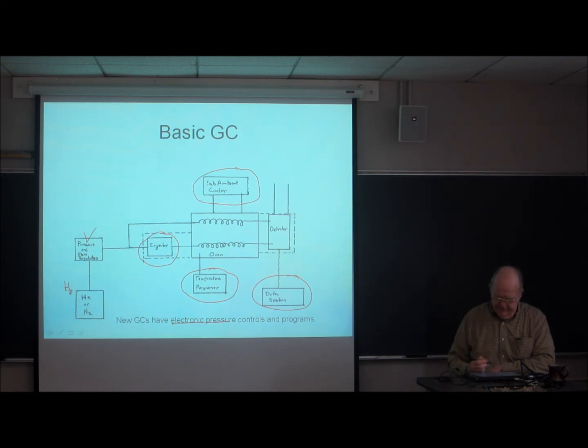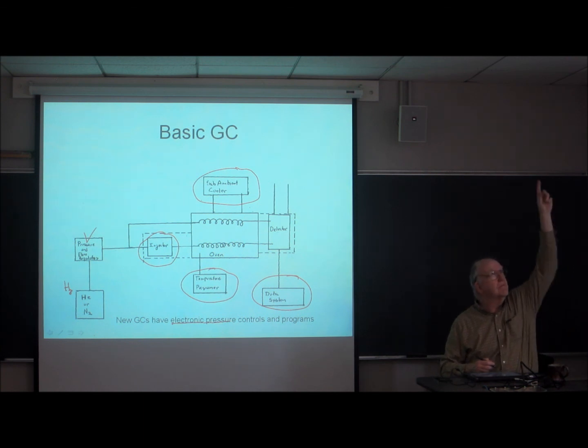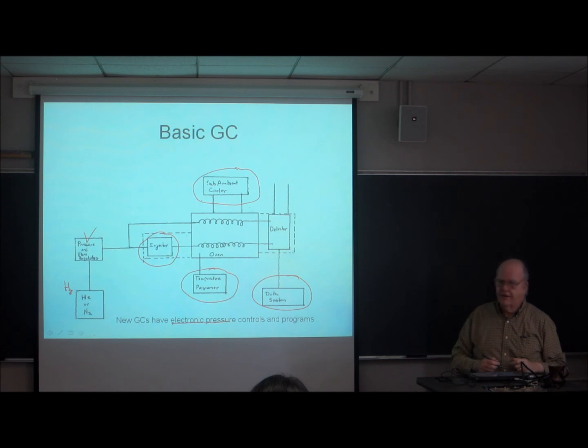If you're doing preparative scale gas chromatography, you need a bigger instrument, bigger columns. Prep scale GCs I've seen as big as the height of this room, and take up a significant fraction of them. They're expensive.